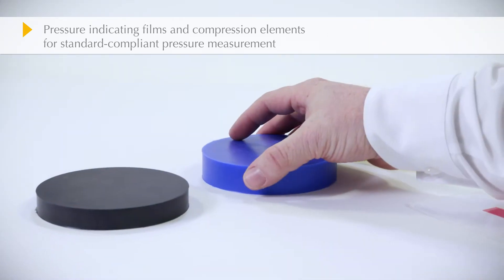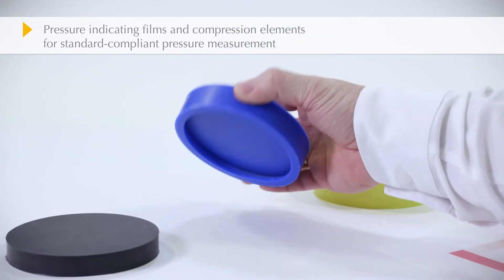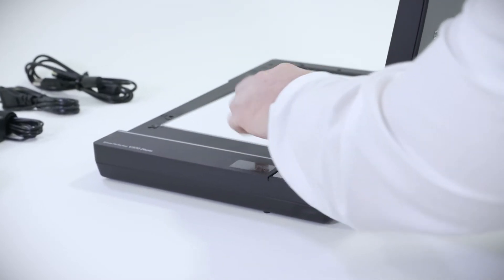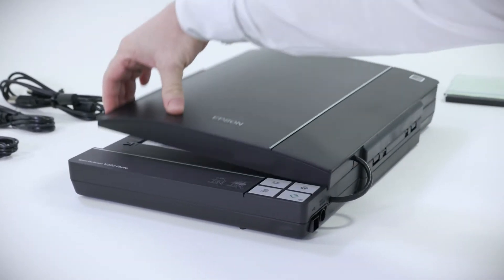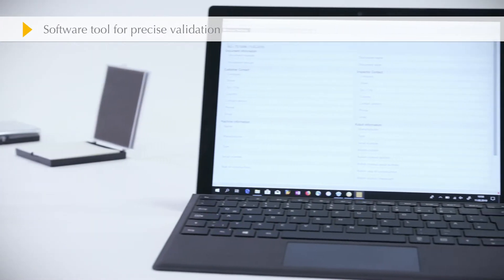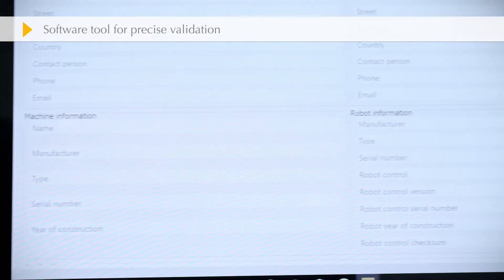The set contains three compression elements which simulate the parts of the body that will be measured. Afterwards, the scanner is used to read in the measured values. A convenient software tool is available for validation.